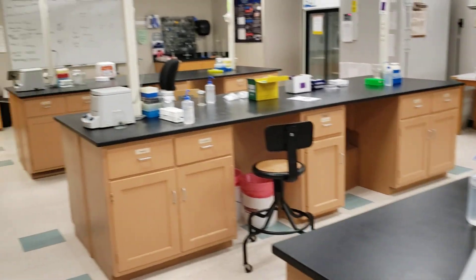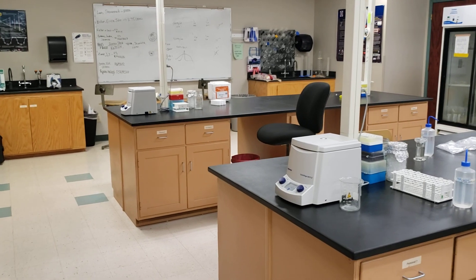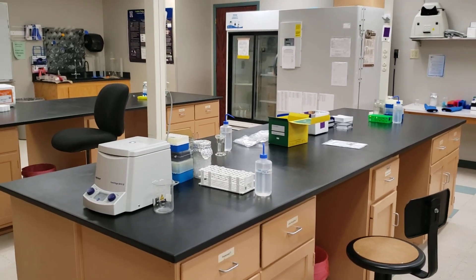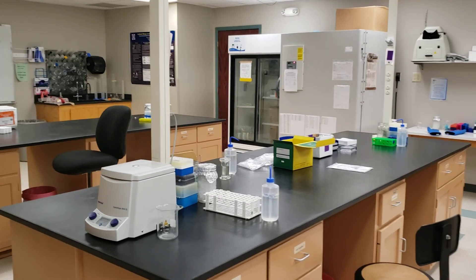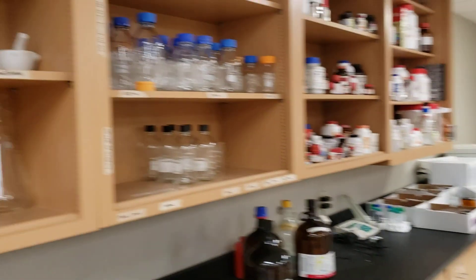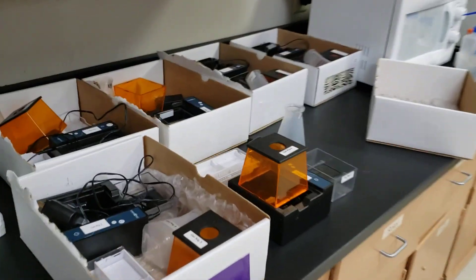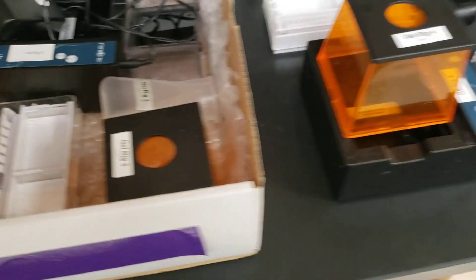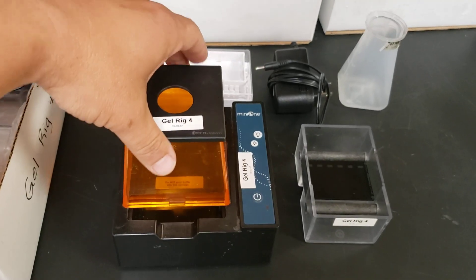At the end of each lab bench there's a small centrifuge, so students at each bench all use their own centrifuge. I discourage them from going to another bench — they have to work together. For example, if centrifugation takes five minutes, they can wait for partners across from them to finish and combine plasmid spins together, so they're really managing time and working collaboratively, which is what happens in a real research lab. I also have gel rigs — I really like the Mini One system. You pour your gels, put it on the power source, everything is built in, power shuts off when you lift the lid.